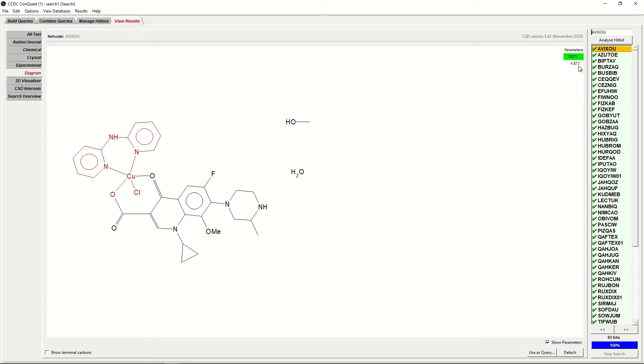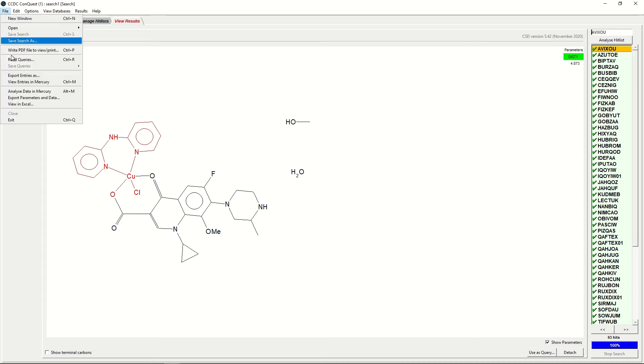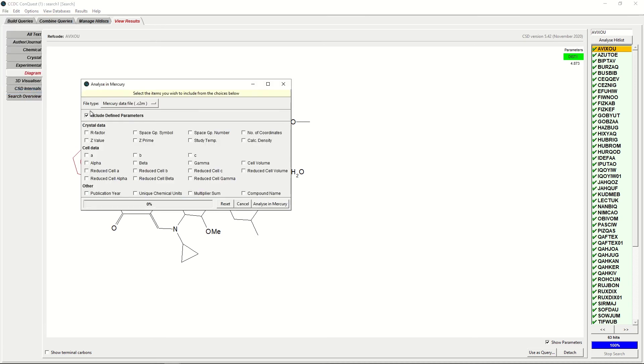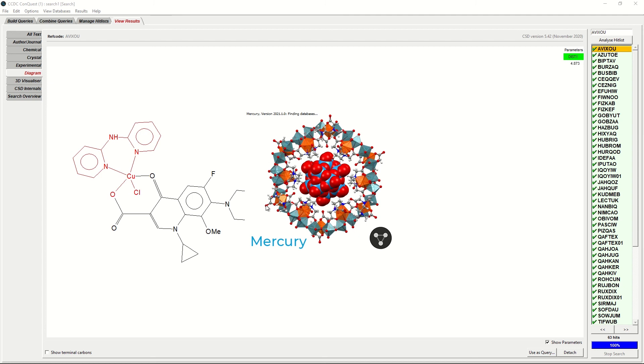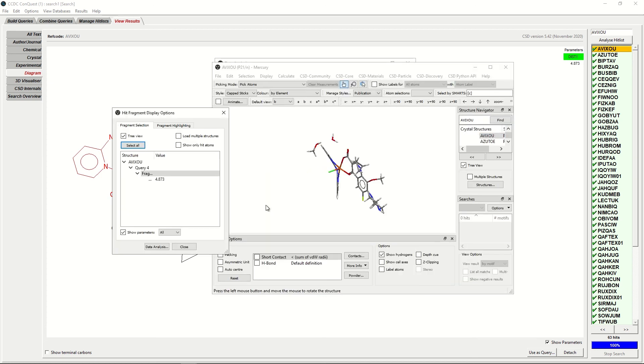Finally, we would like to analyze this data and tabulate all of the distances between the centroids for each of these ref codes. To do this, we will use Mercury's data analysis module. We'll do this by clicking File, Analyze Data in Mercury, and as we're happy with our default components, ticking Analyze in Mercury. The Mercury window will then appear. Your tabulated data may be hidden behind the 3D visualizer, so it's back here for me.